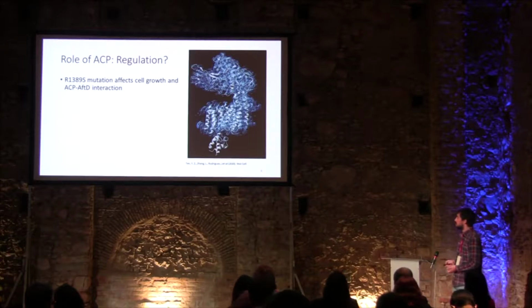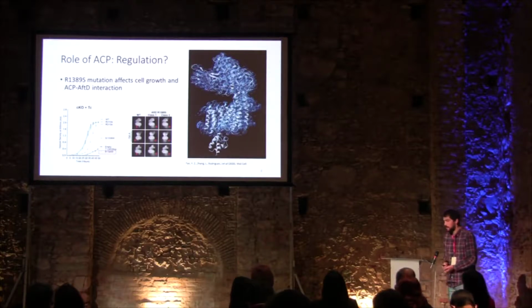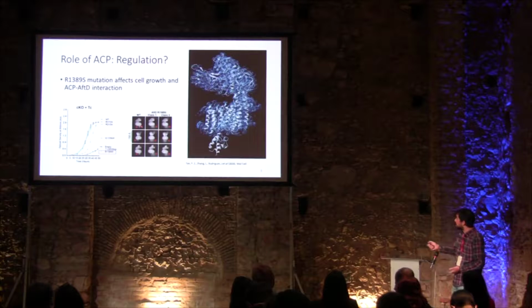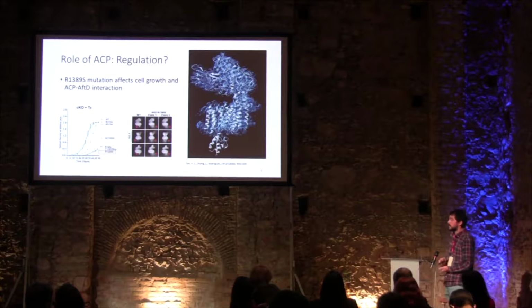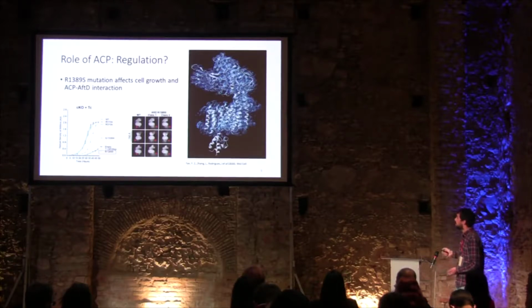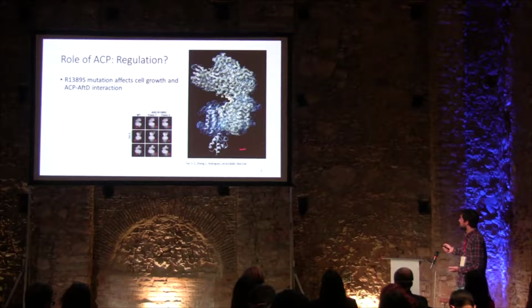So we also determined the structure by cryo-EM. And we weren't successful in abolishing the interaction. So if you can see the wild type, you can see the ACP density here very well defined, and the mutants, even though it's not well defined, it's fuzzy. So the ACP is still there, but it's more flexible. So therefore, we couldn't model the protein to the density.